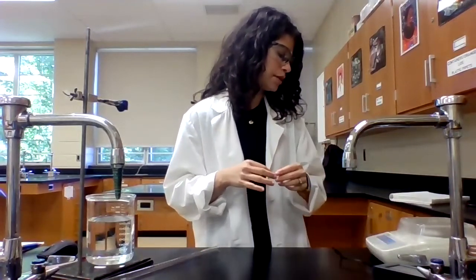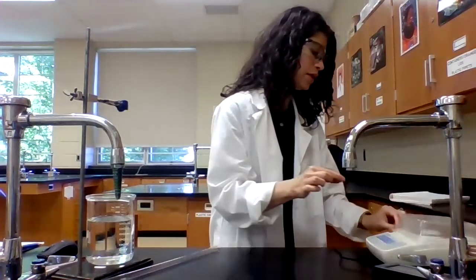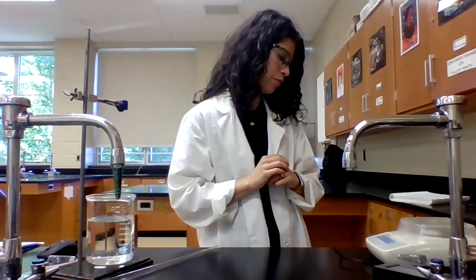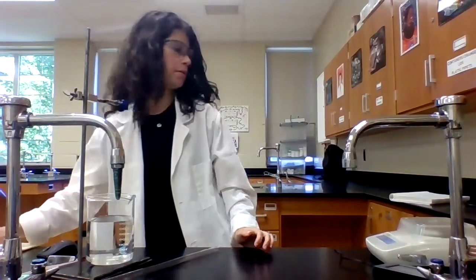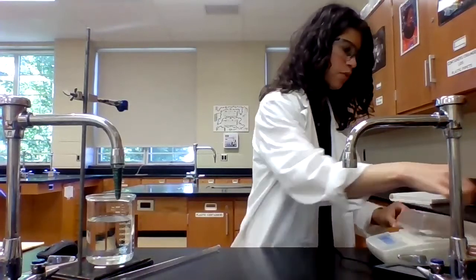So I'm going to zero the balance and put the magnesium ribbon on, and it has a mass of 0.027 grams. So I have the mass of my magnesium ribbon.